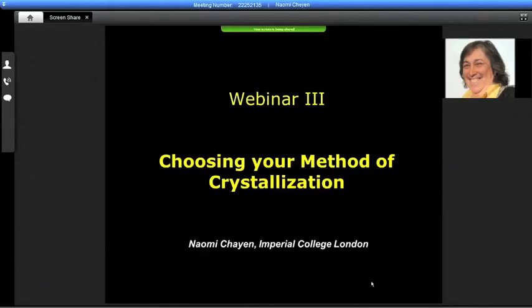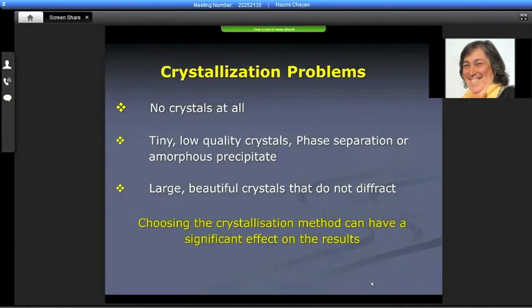Moving on to webinar 3, the third part of the webinar, I'd like to describe in a few case studies and show how you choose your method of crystallization. Often people ask me, what will we choose? How do we do it? So again, coming back to what we started.